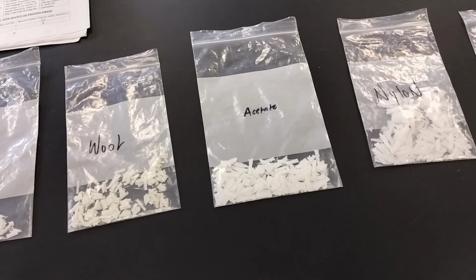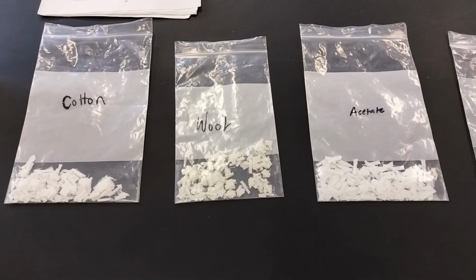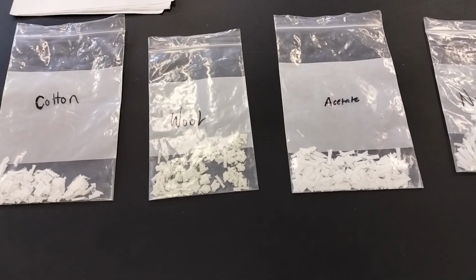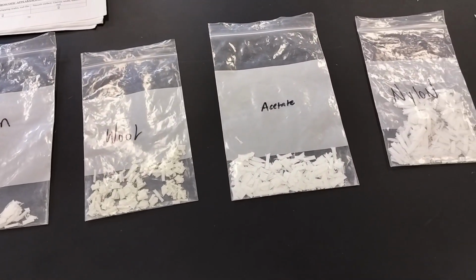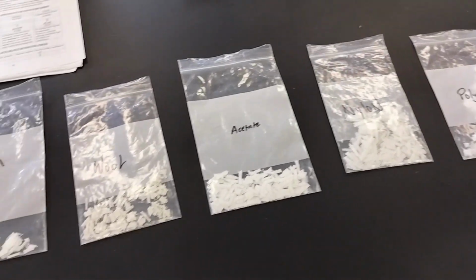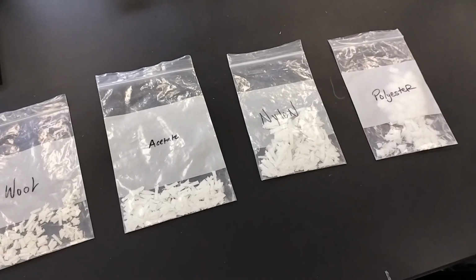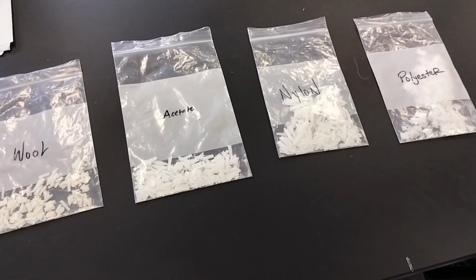Chemical tests use specific chemicals to dissolve or react with fibers, helping us confirm their identity. In today's lesson, we will learn how to identify cotton, wool, acetate, nylon, and polyester using different chemical solutions.